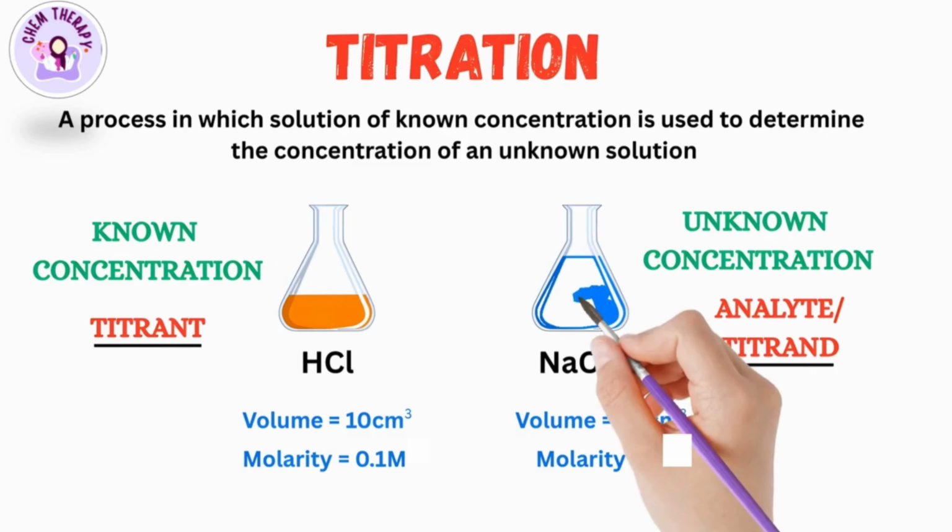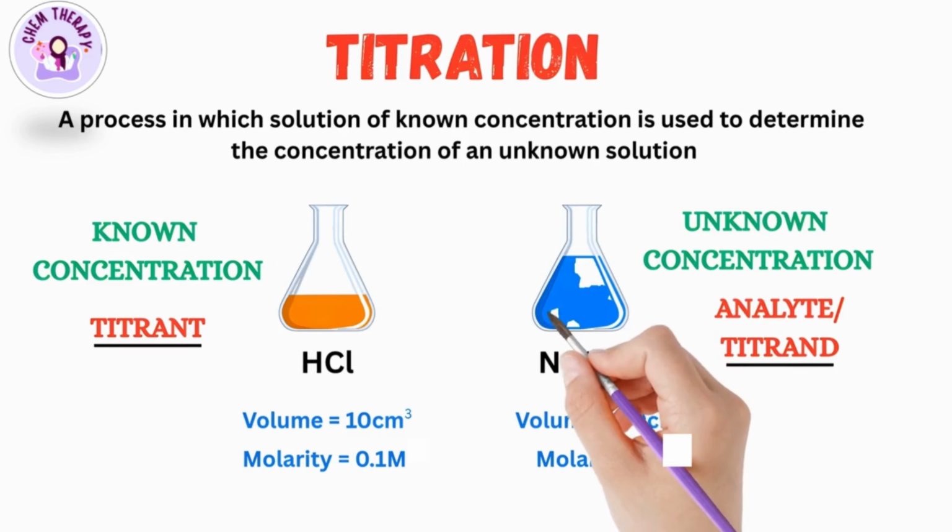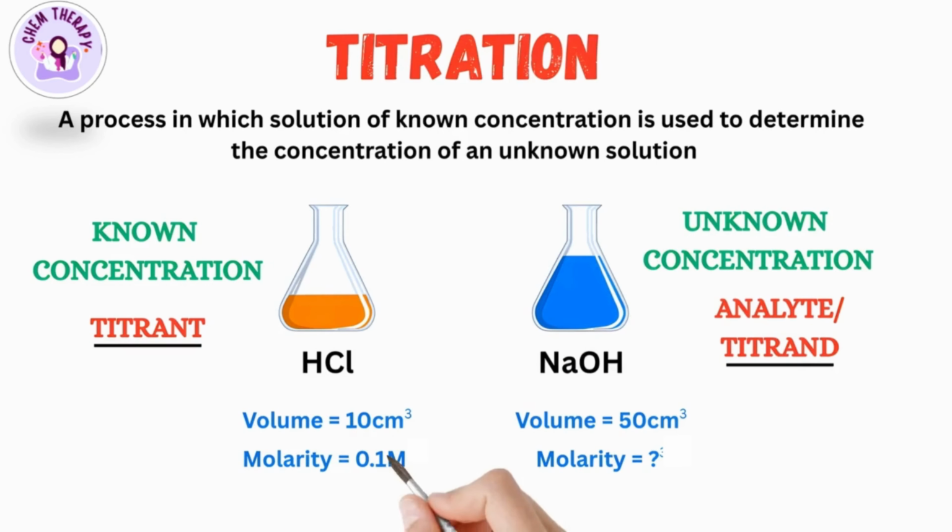Of these two solutions, one is acid and the other one is base. So this type of titration is called acid-base titration.